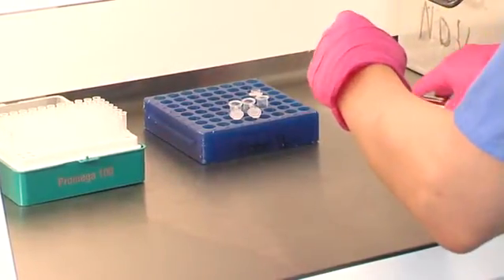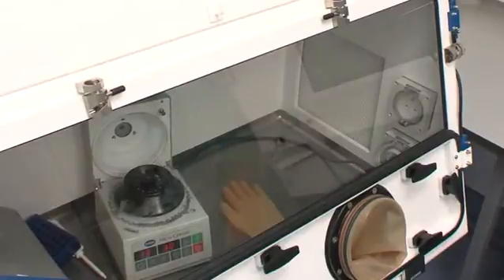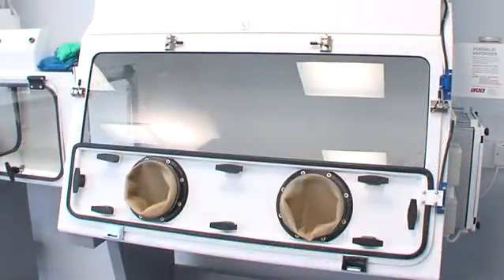For equipment that is aerosol generating such as mixers and centrifuges, a class 3 cabinet should be used where possible.